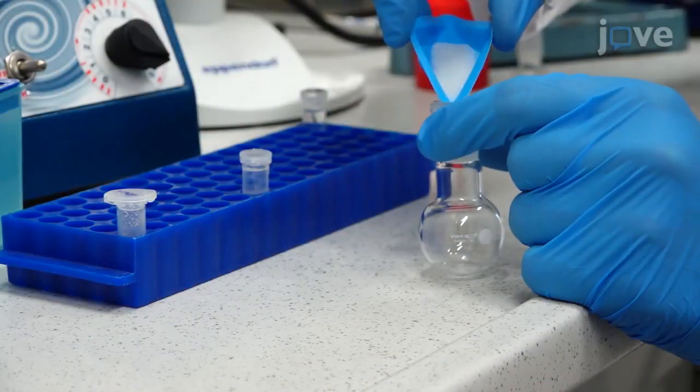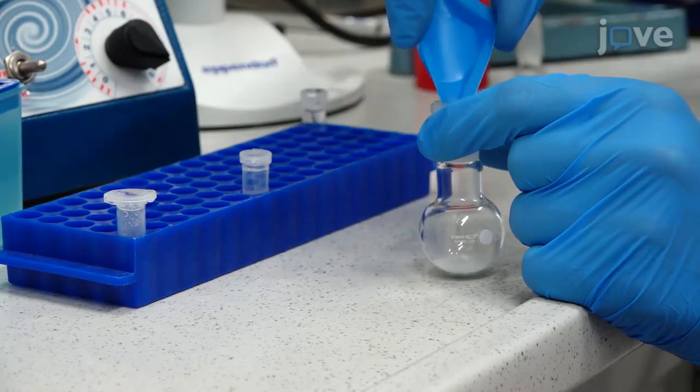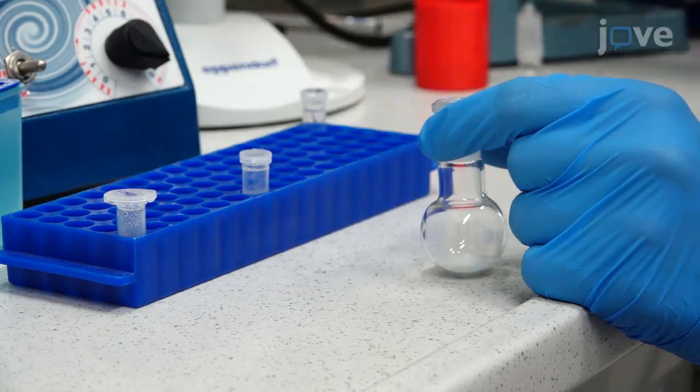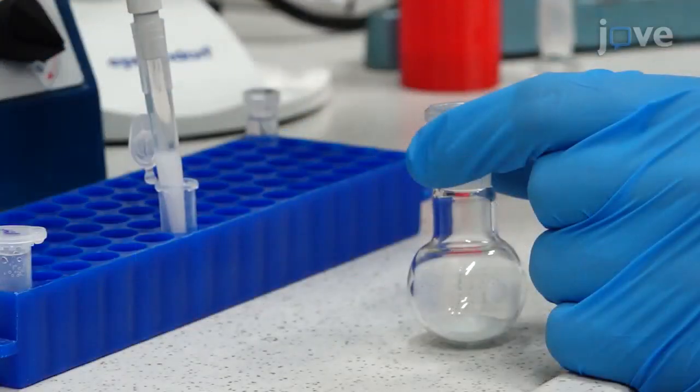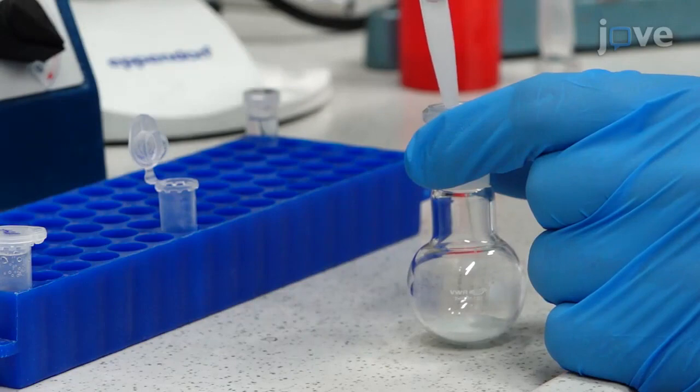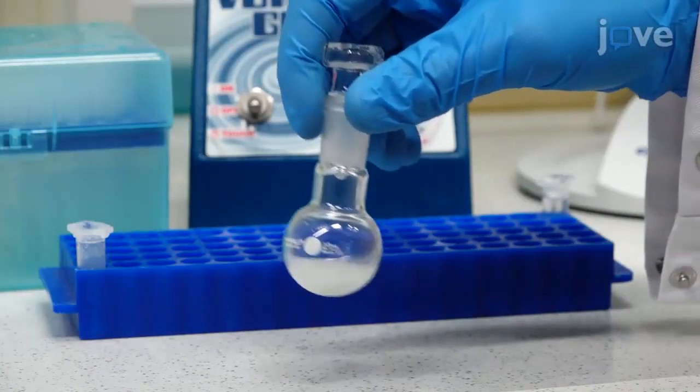Next add 1.5 grams of spherical glass beads to a 10 milliliter round bottom flask. Add the ELP and chloroform methanol solution to the round bottom flask and gently shake to mix.